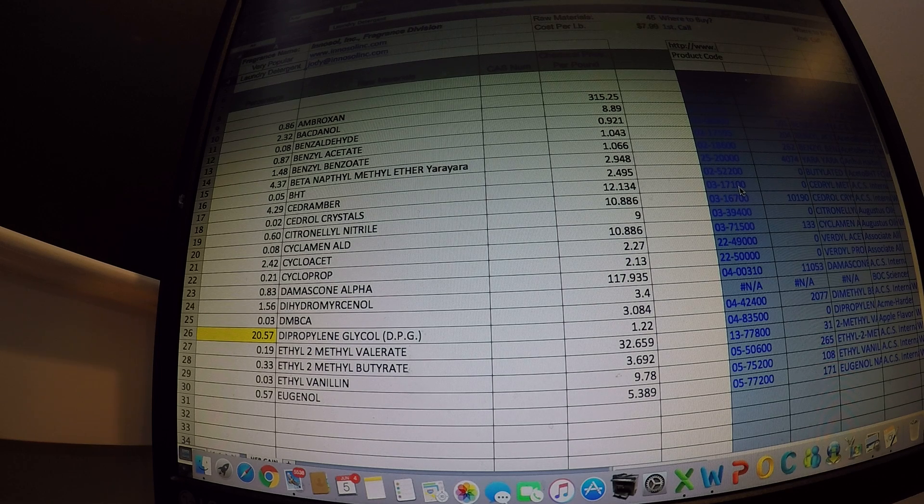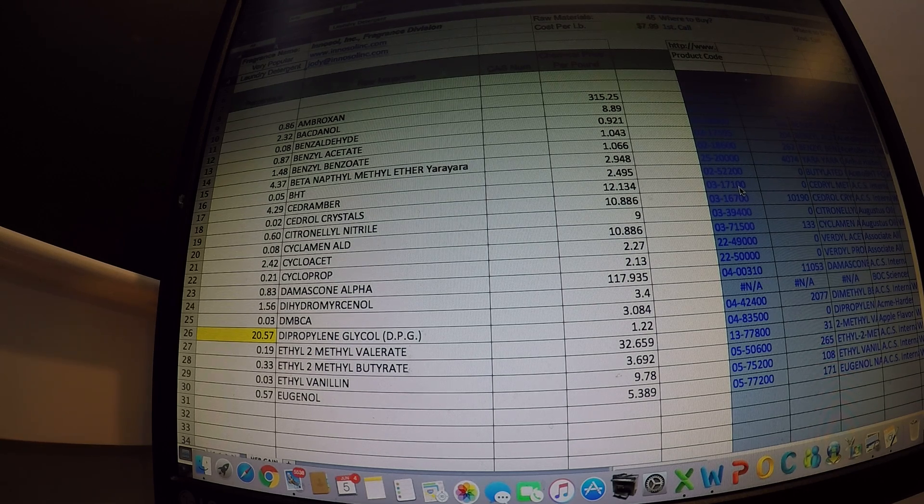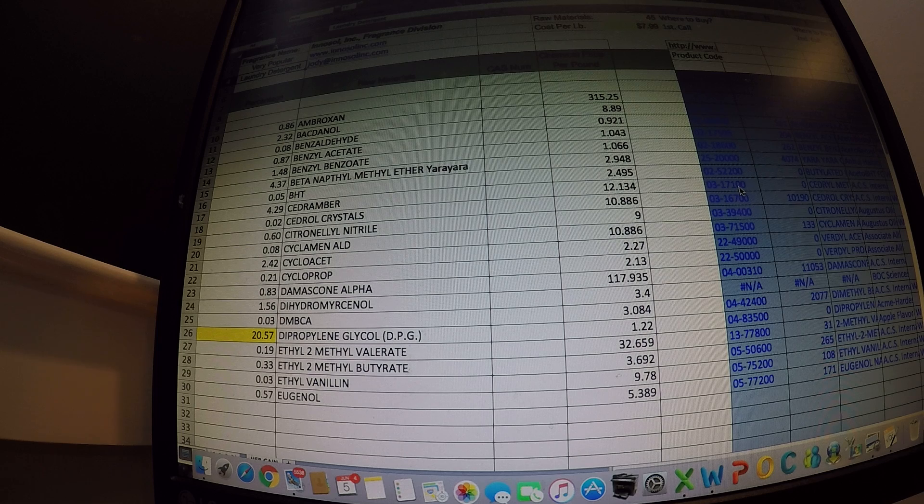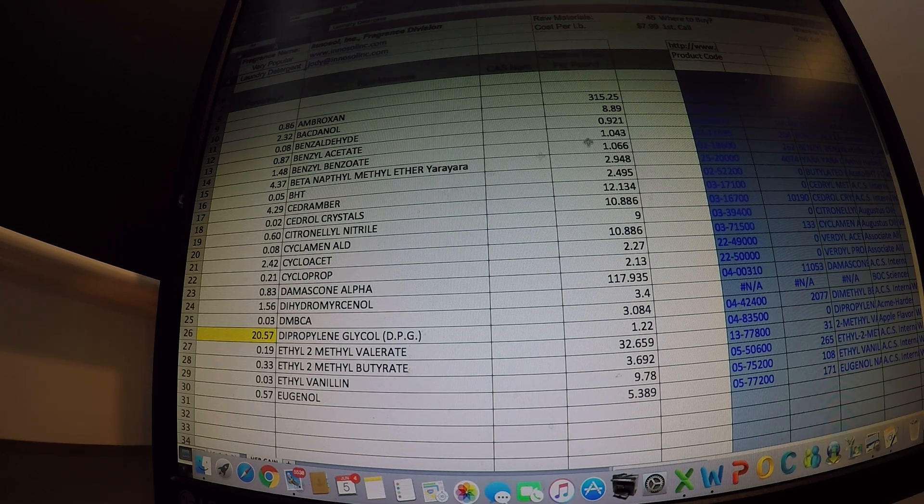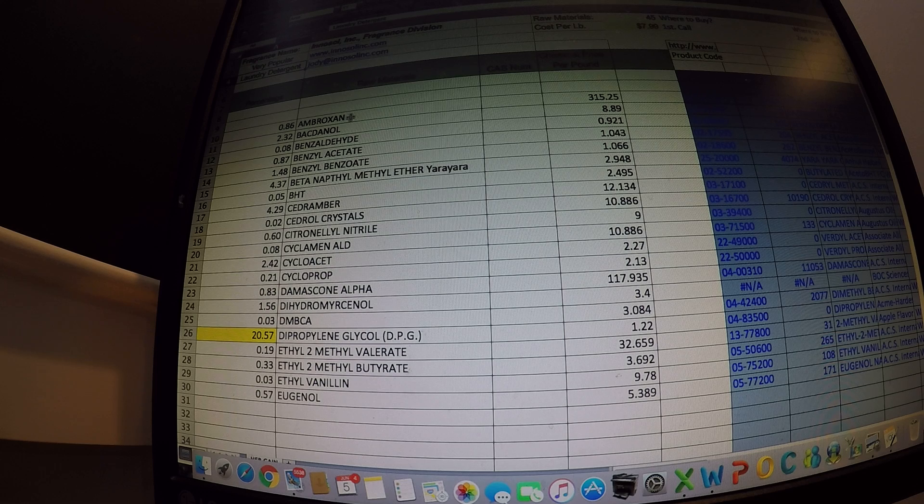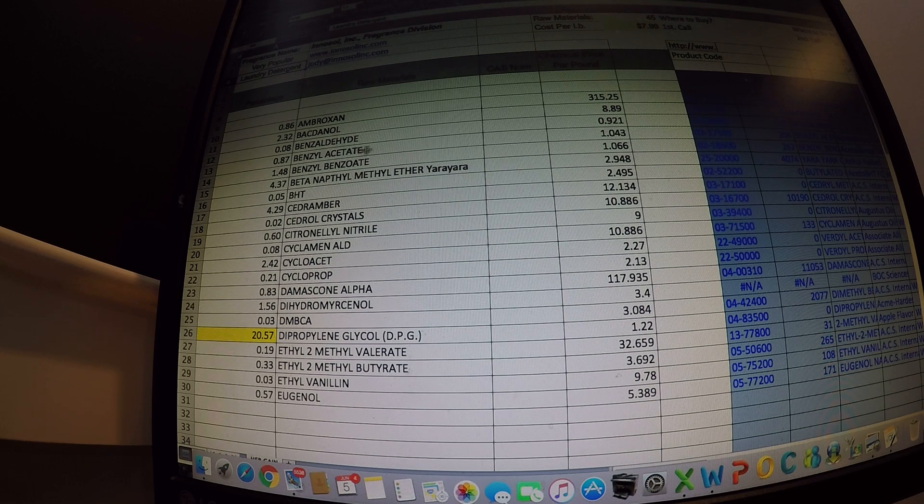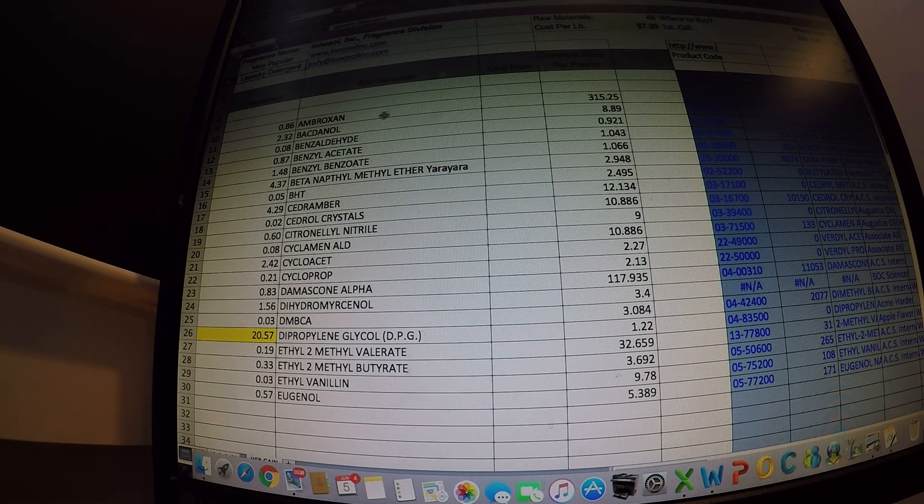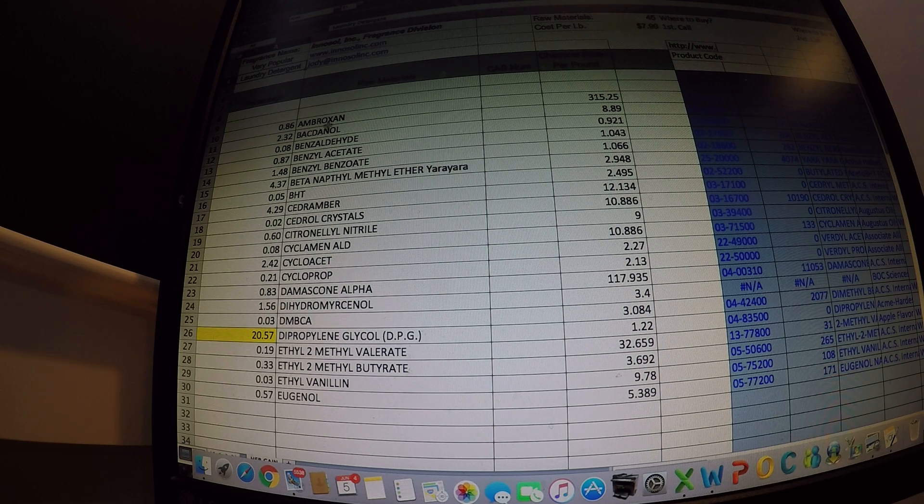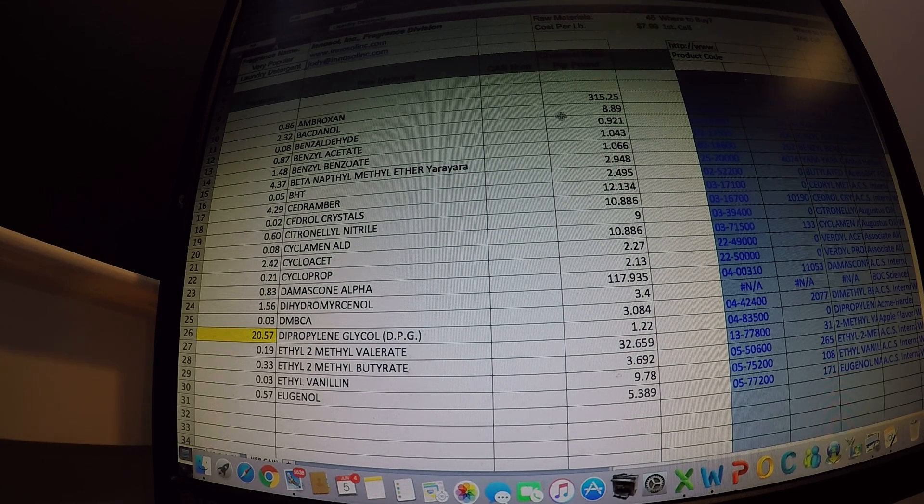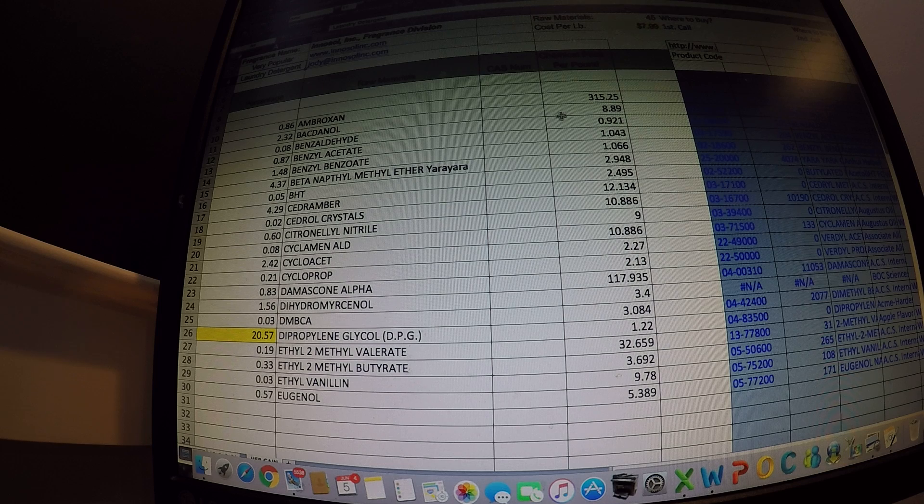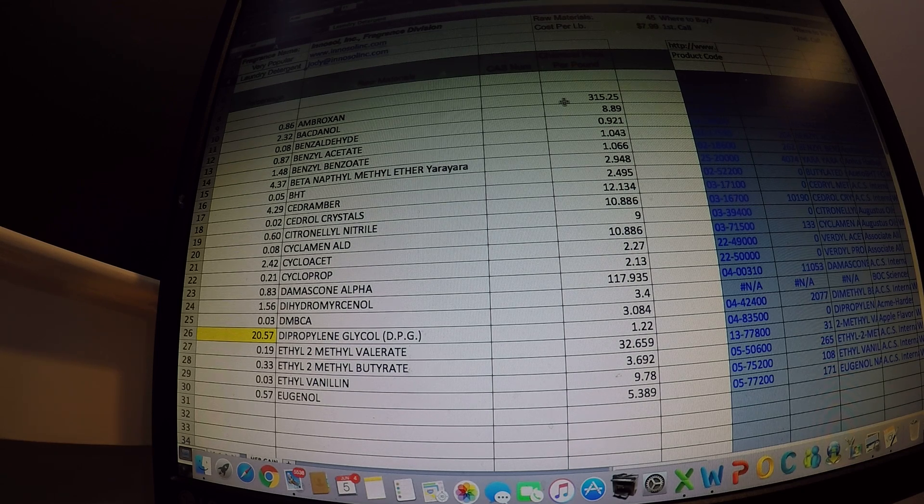So if you look at the computer screen right now, this is a very popular laundry detergent we've made in the past. And if you look up here, there's a chemical called Ambroxan. We use less than 1% because it's super strong and you don't need much of it, but it's also three hundred fifteen dollars a pound.